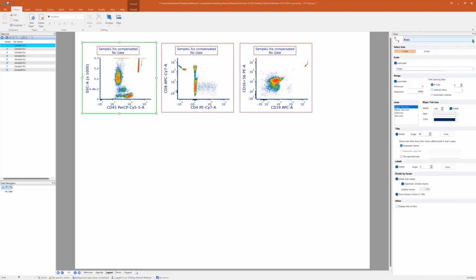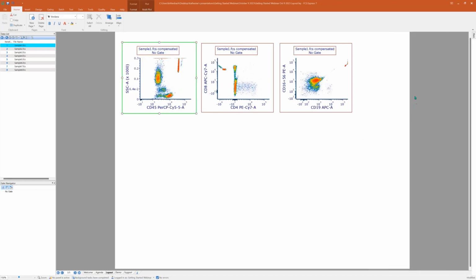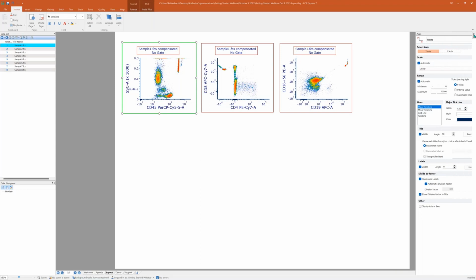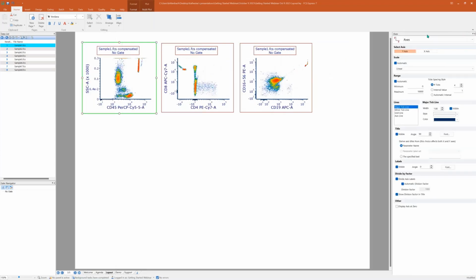And you also have the opportunity to pin or unpin your dockable windows. Here it's called auto hiding. So if we click this pin, then it will be pinned to the side so that it really is out of the way, but then we can hover over that tab to make it appear. I'll keep this unpinned for now.